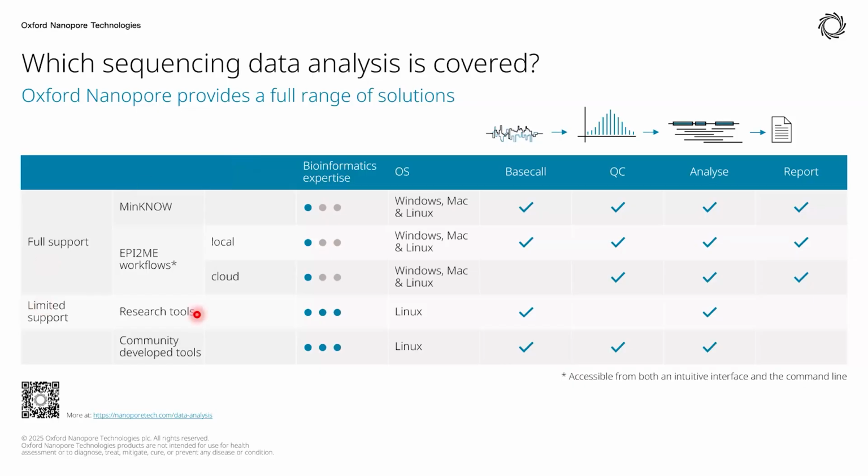There is another software, which is EPI2ME, and Matt is going to talk more about that. So what is EPI2ME? EPI2ME is a software solution which provides a user-friendly graphical interface and access to cloud or local data analysis.